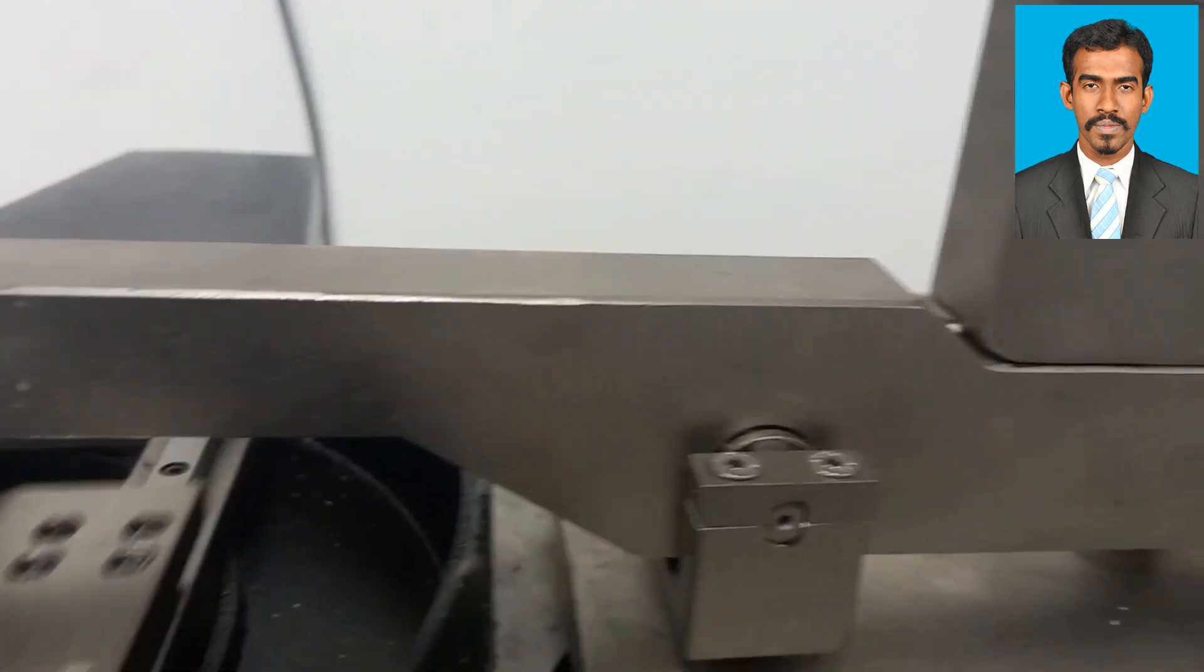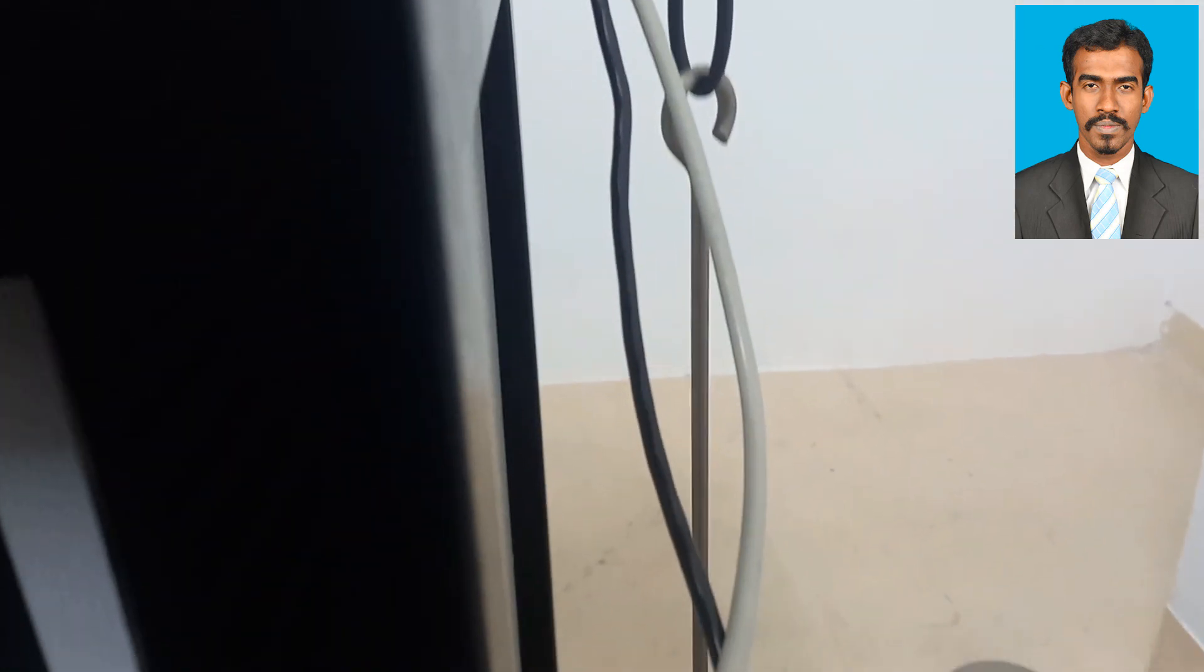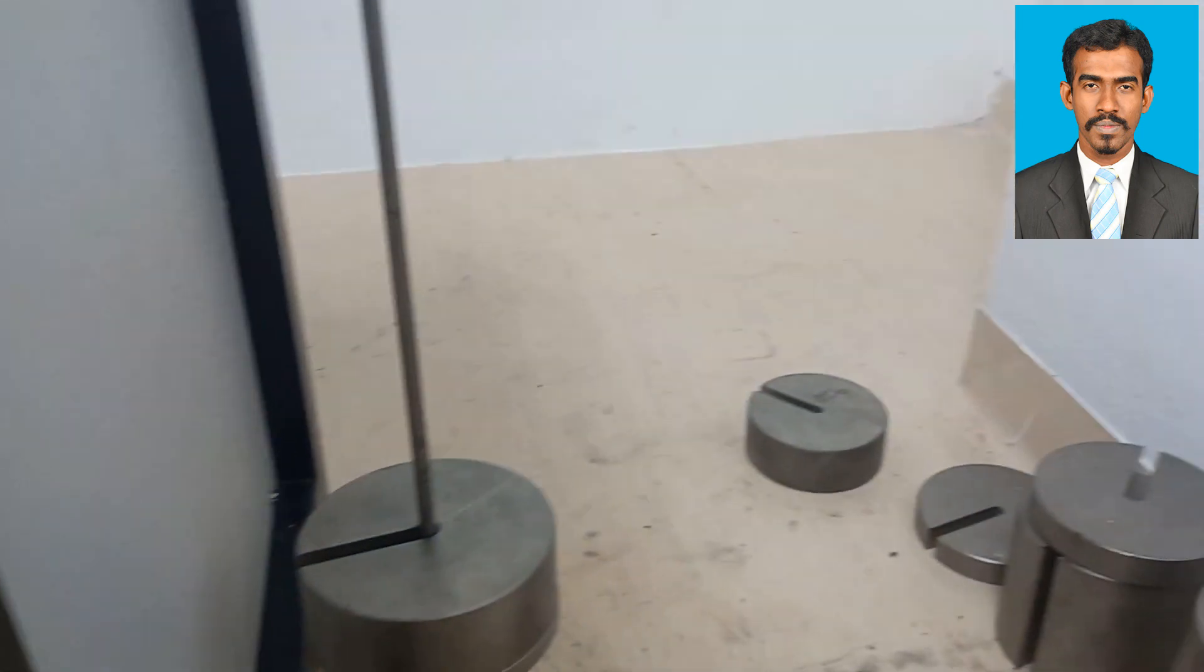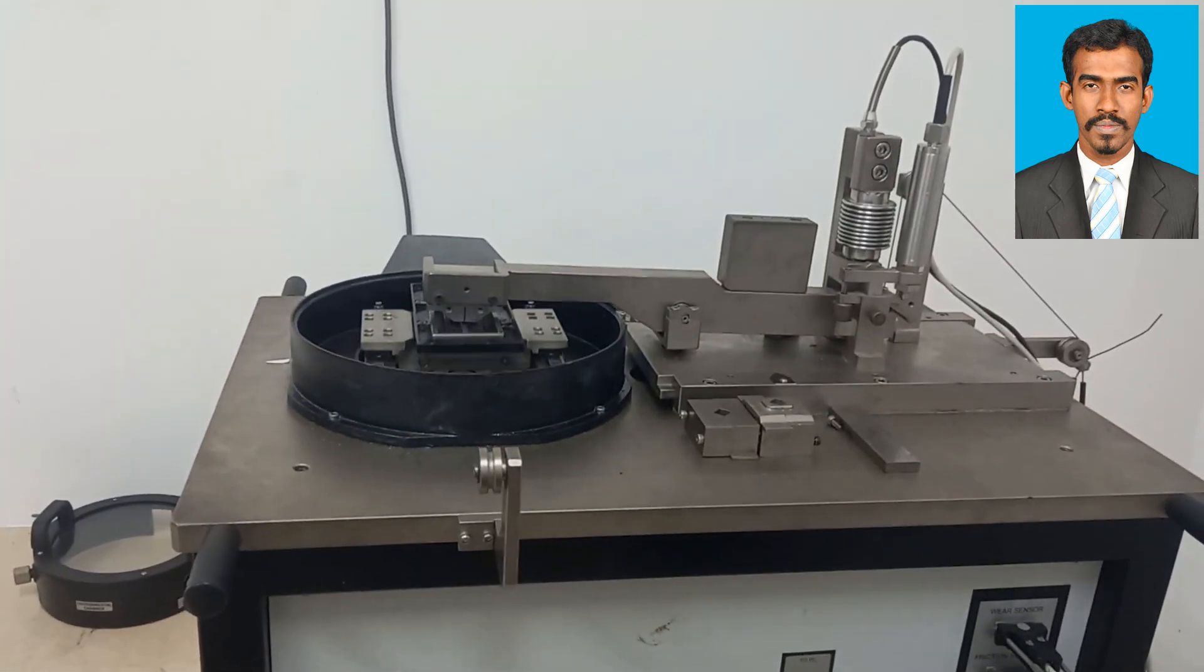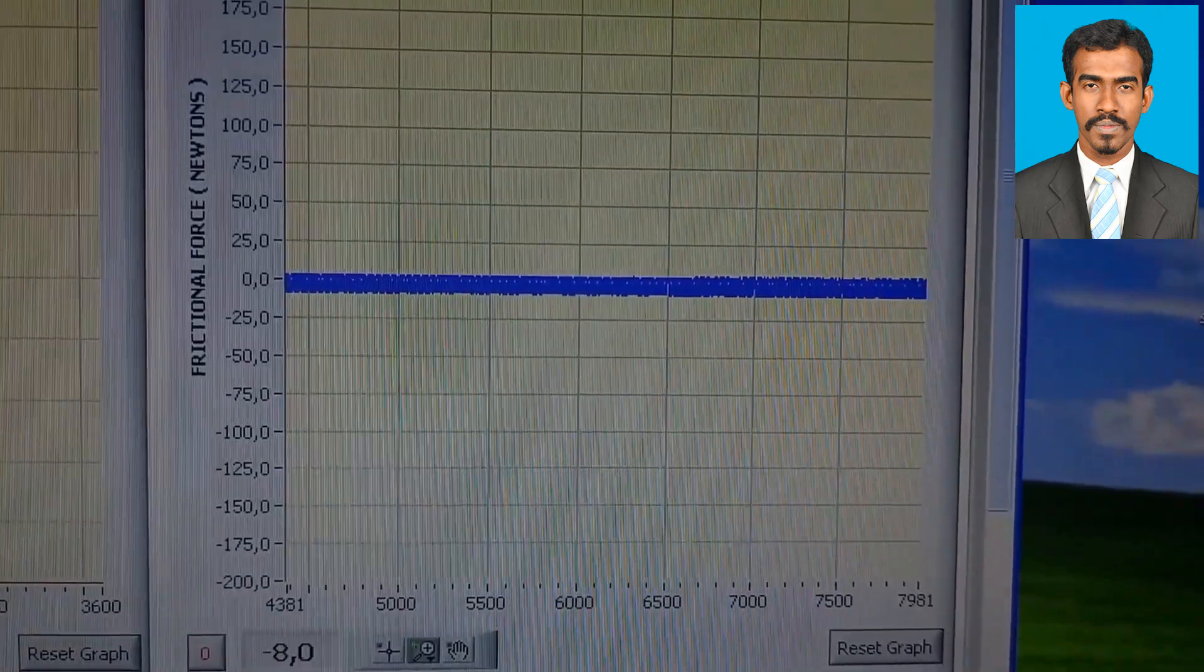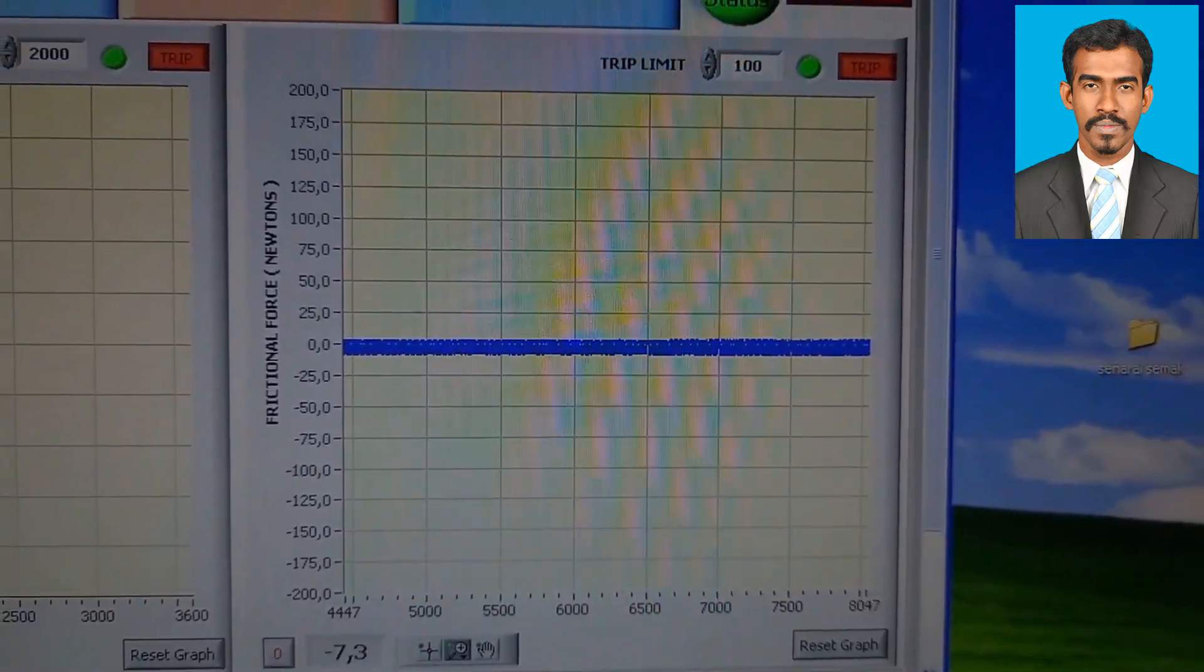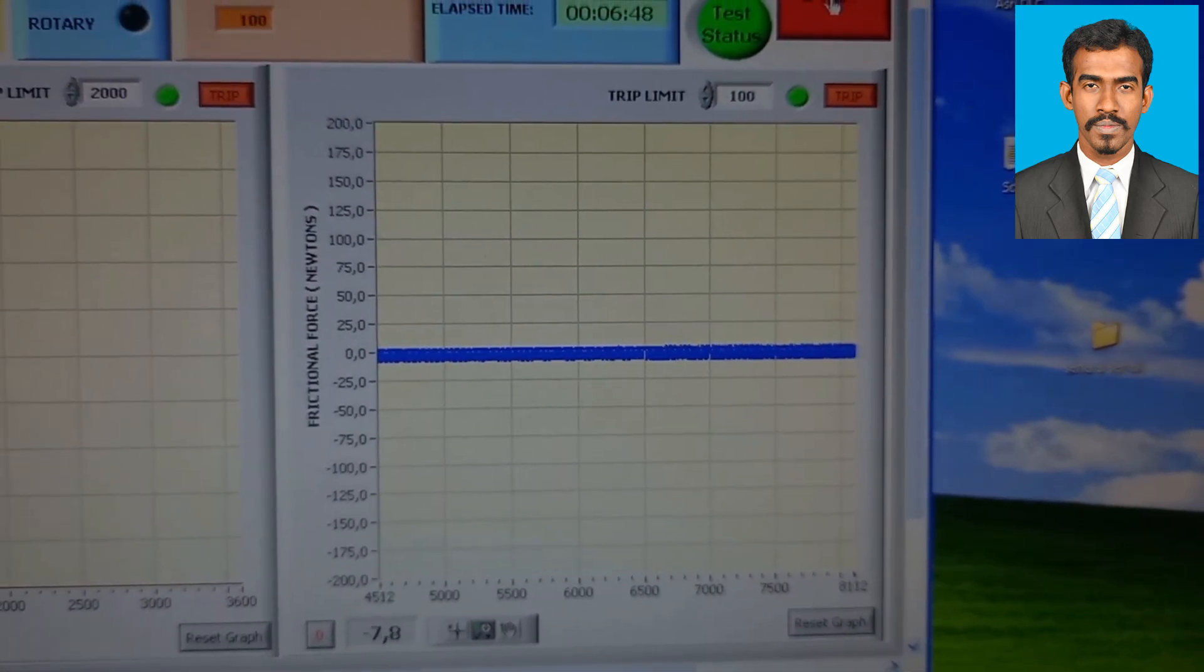Here my experiment is reciprocating, so it's moving back and forth. When the machine is running, we can observe the graph. Since I applied 2.5 kilos, friction should be below 25 Newtons. We can check with the graph. If it is above 25 Newtons, then there is something wrong - either extra vibration or the alignment with the specimen and the ball.